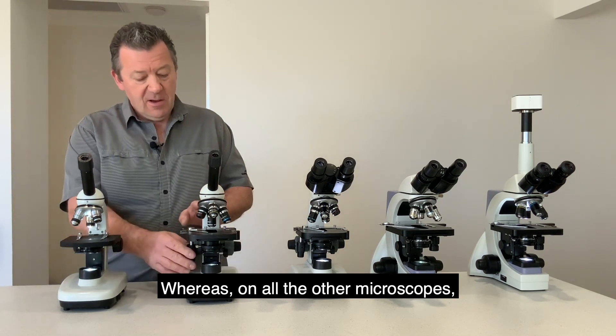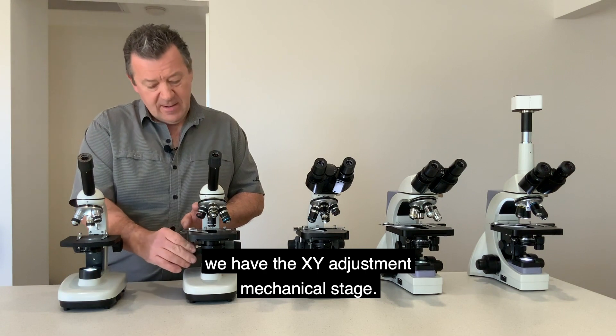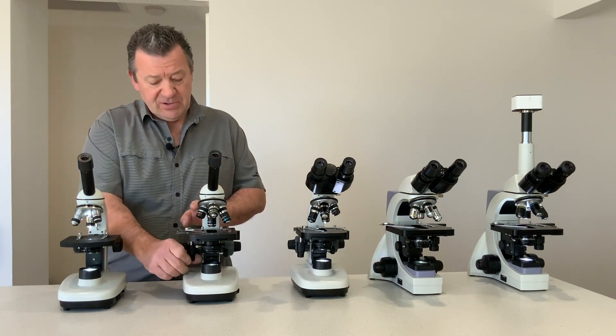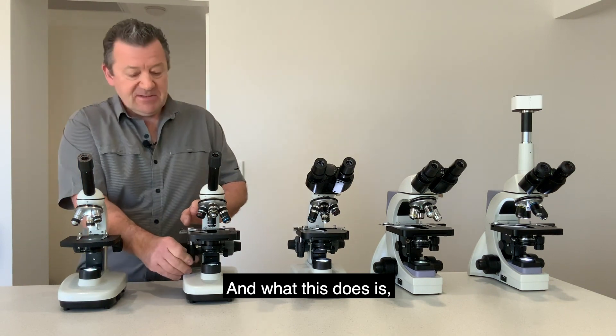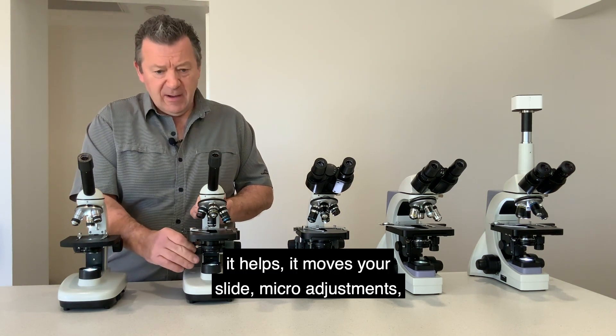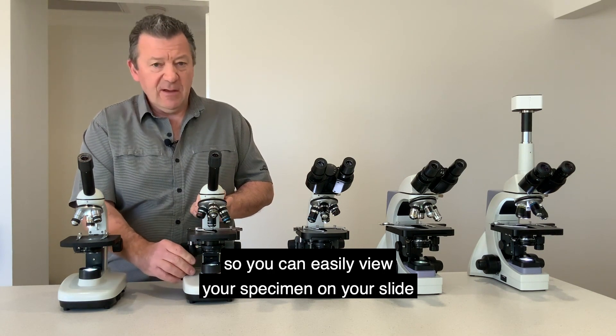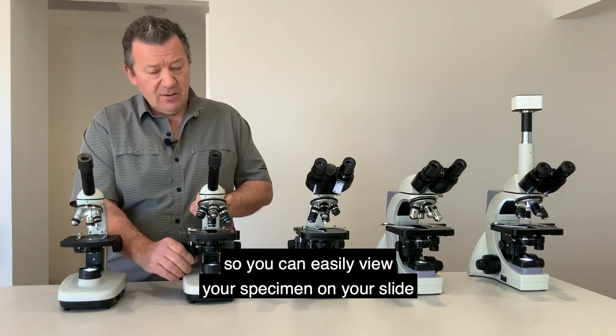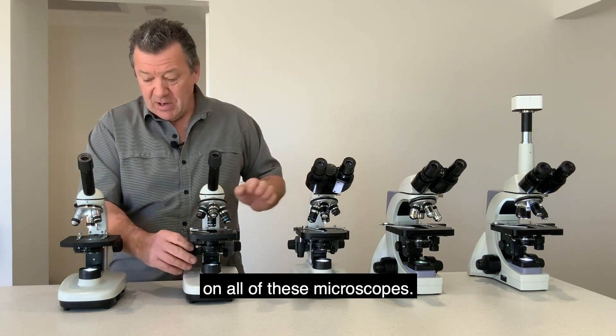Whereas on all the other microscopes we have the XY adjustment mechanical stage, which allows micro adjustments so you can easily view your specimen on your slide.